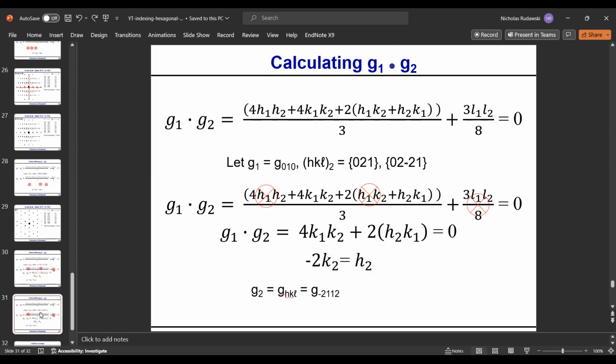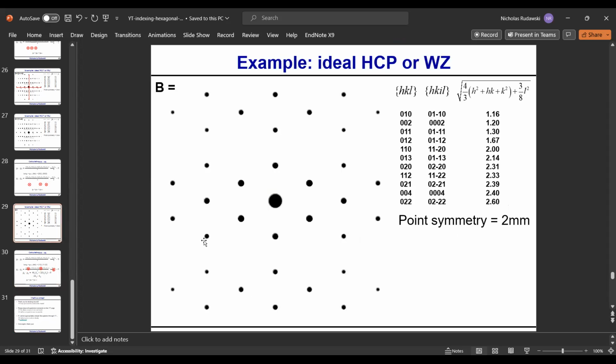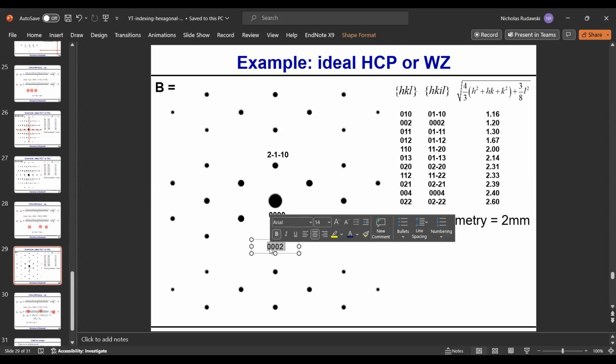So let me go ahead and delete this panel so we don't end up causing an issue. Okay, so let me go back here and copy some text box as well. So here's my G1.